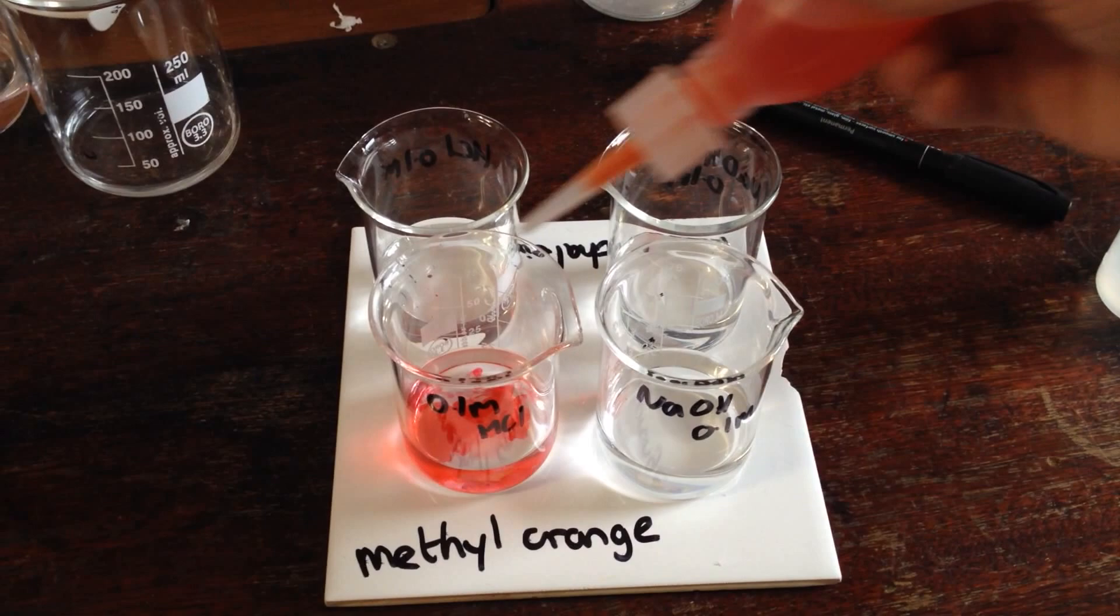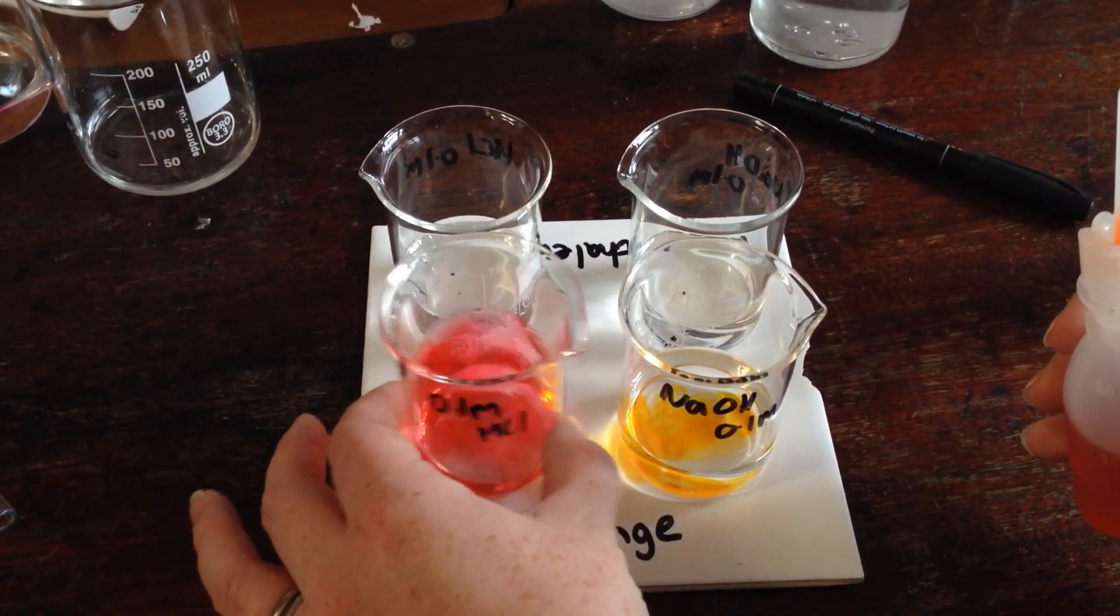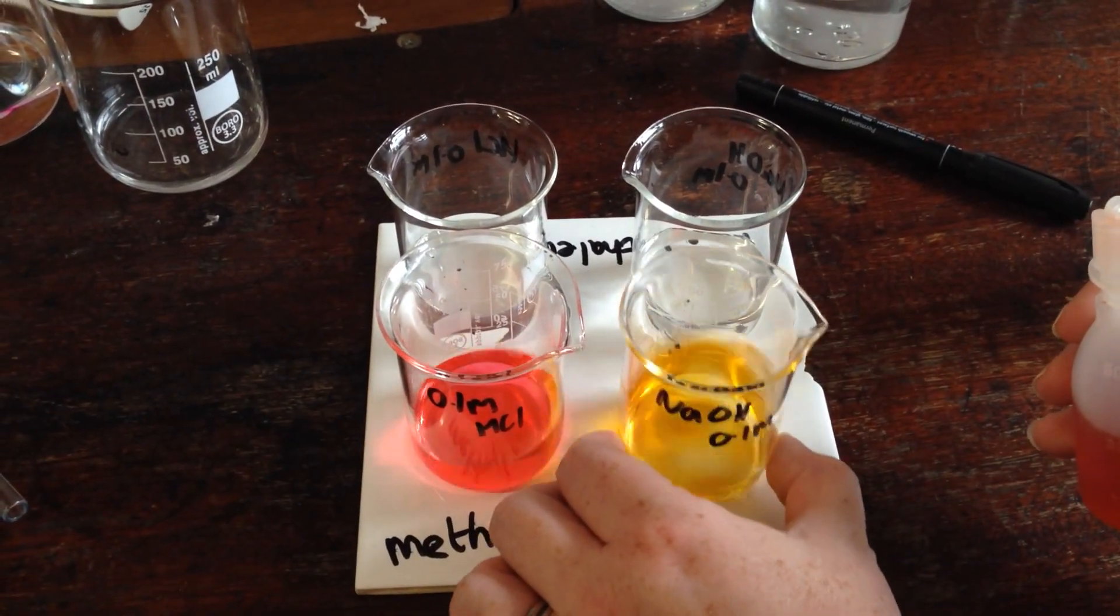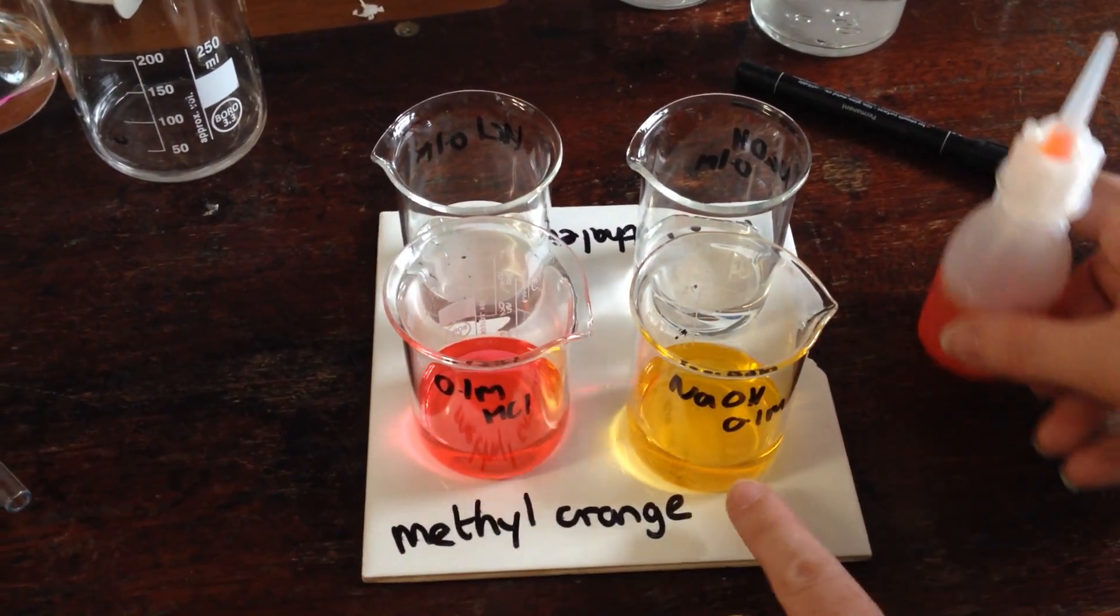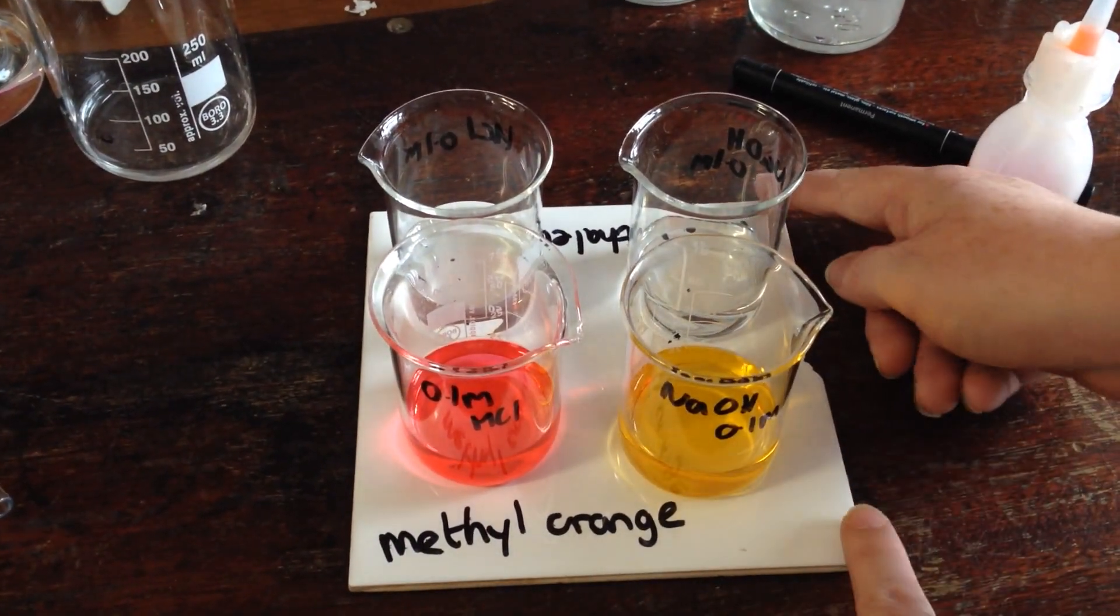I'm going to add in a few drops, give it a little swirl. You can see that methyl orange in acid is red and in alkaline is yellow.